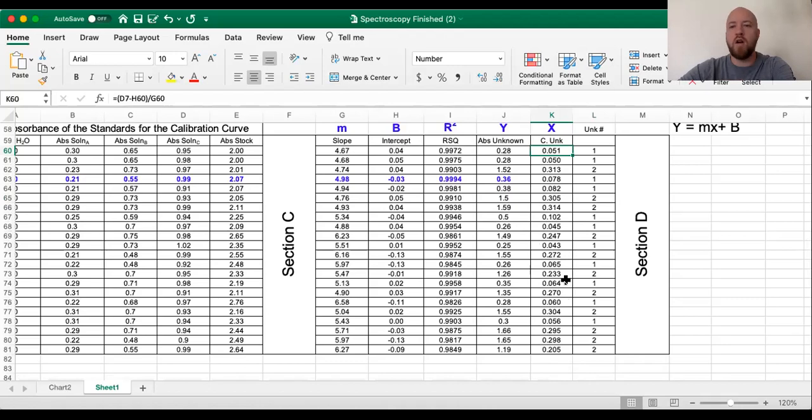A paragraph, same kind of context as before. What was the purpose of the experiment? How do we go about doing it? What is the result? There is no further analysis part. The fact that one of them is 0.015 or something like that has no further meaning than that. That's just a concentration. So what was the purpose? How did we go about it? What was the result? Those are the three things you should be thinking about for your conclusion.